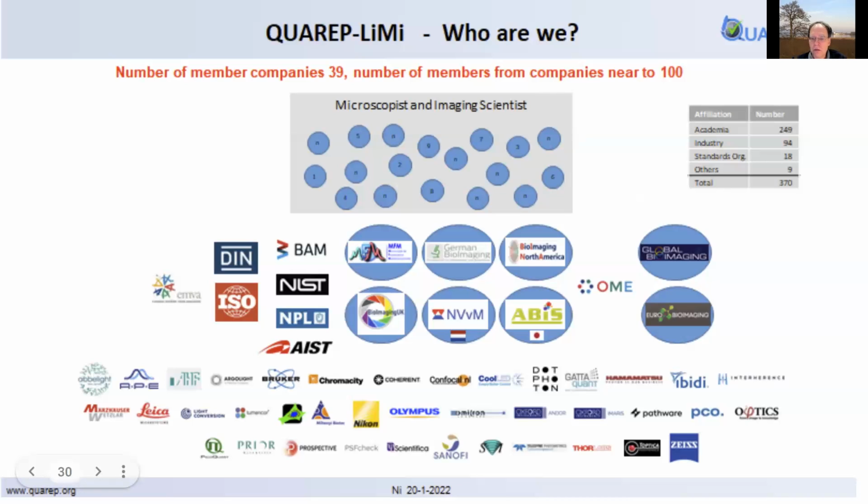And this is the approach we had to take, because in the end we need acceptance, not only among people doing research or handling microscopes, but also at the companies producing instruments, because we need the metadata, and the best is to have the metadata already included when you do the experiment or the imaging. Next slide, please.